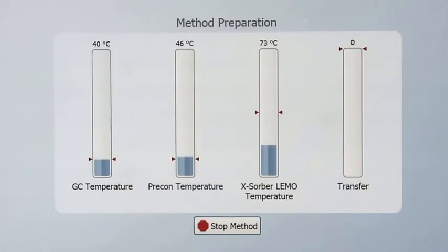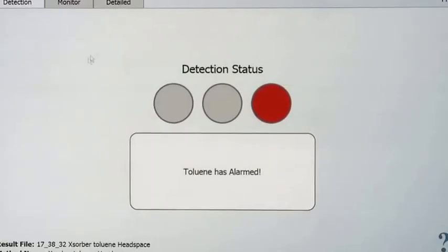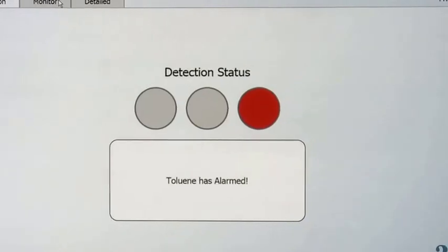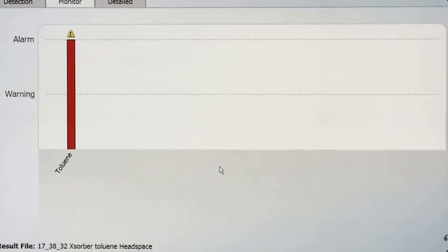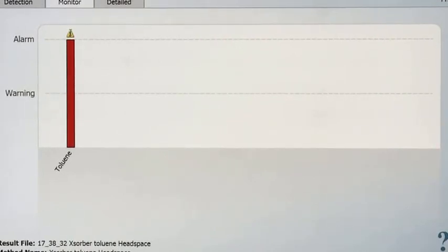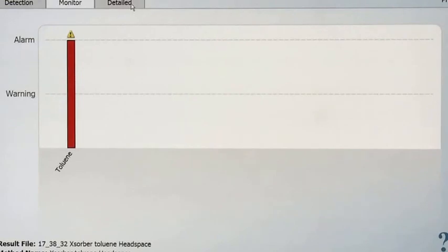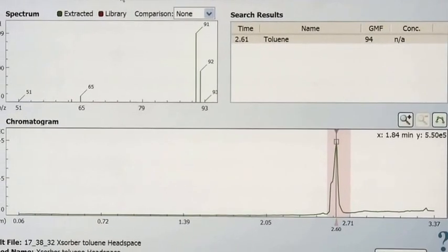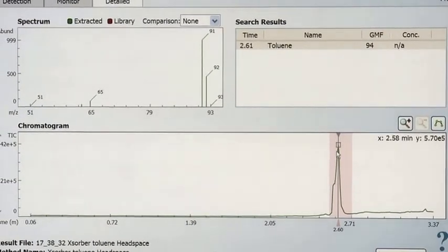The method has been in progress and you can see by the red light that the detection status has found the chemical toluene and it's showing us an alarm. From there, based on how you've trained your operators, they should know the appropriate protocol for what to do.